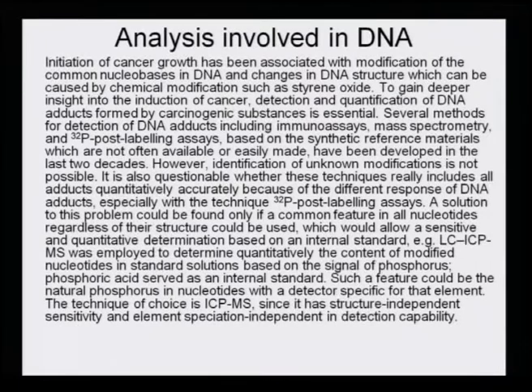A solution to this problem could be found only if a common feature in all nucleotides, regardless of their structure, could be used, which would allow a sensitive and quantitative determination based on an internal standard.